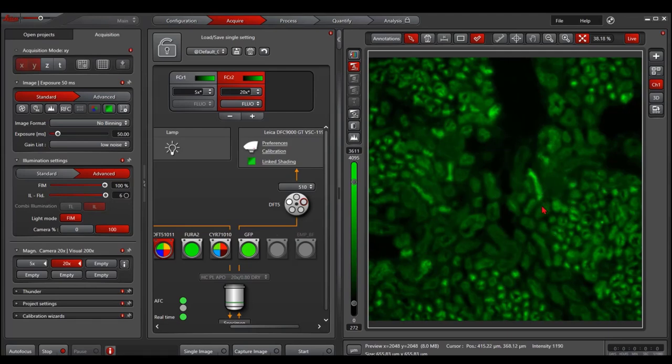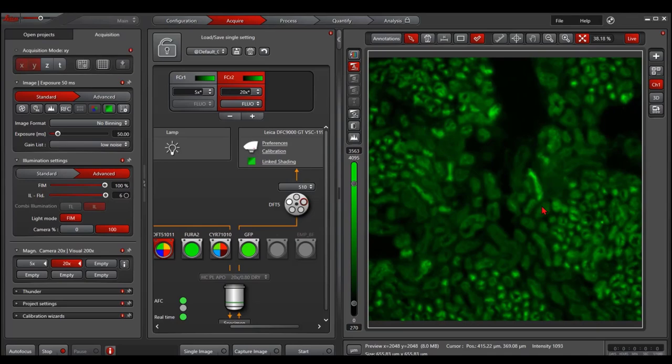In this case, we need to do the pathfocal and the pathcentral adjustment. I will show you how to do it in the hardware configurator.